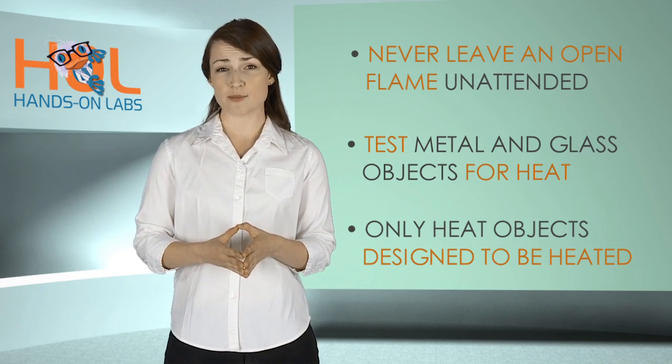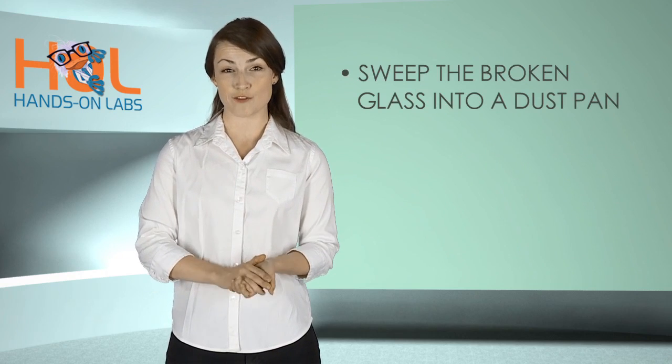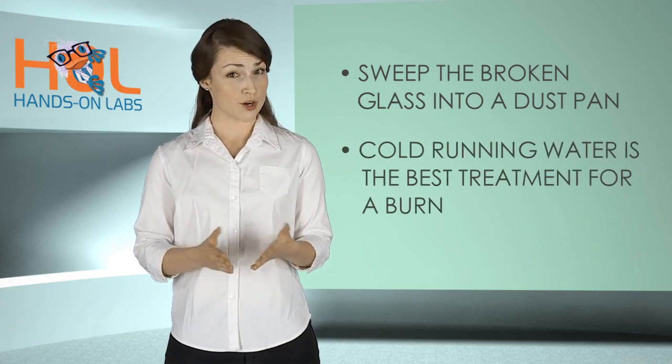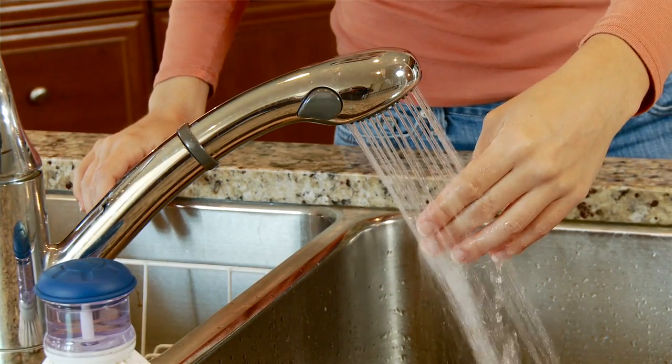If a glass object shatters or breaks, don't risk a cut by picking up the glass with your hands. Instead, sweep the broken pieces into a dustpan and carefully dispose of them immediately. If a burn occurs, cold running water is the best treatment, followed by medical attention if necessary.